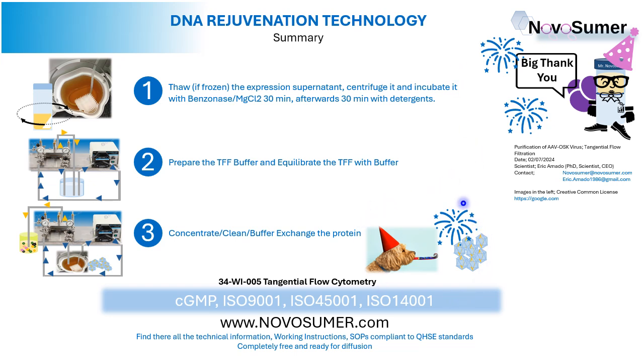Yay! We have the protein super, super clean, almost ready. Well, there are a couple more steps that are needed in order to purify the protein properly. At that point, the protein is very, very clean, close to 95%, sometimes 99%. So we require another step in the purification process, but we will see it in the following video.